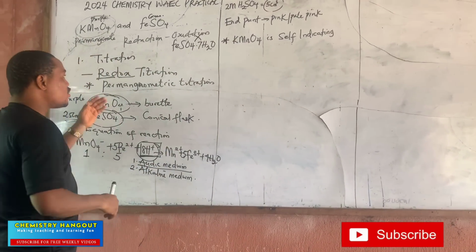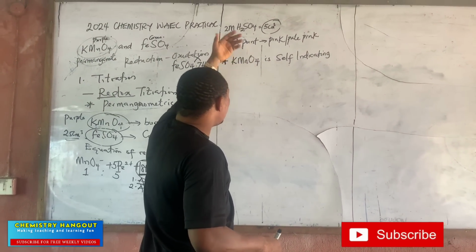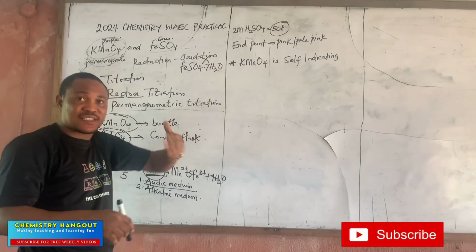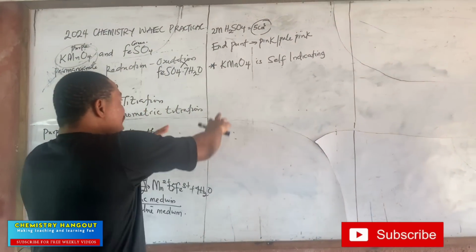I want to believe that's clear. So you run this maybe 3 or 4 times. You know your rough first, second, third, or you will do rough first and second. I want to believe that is clear. Then you now prepare your table.